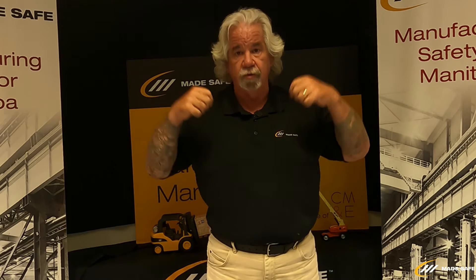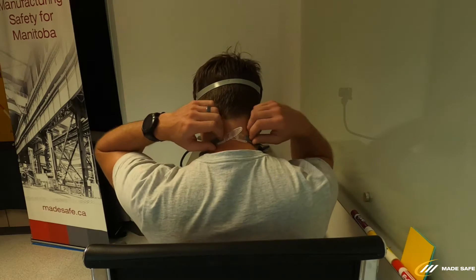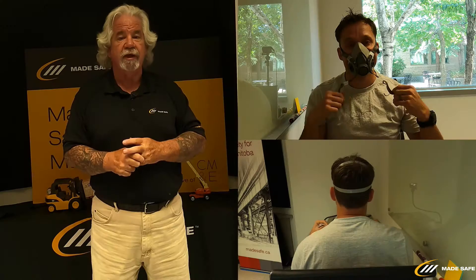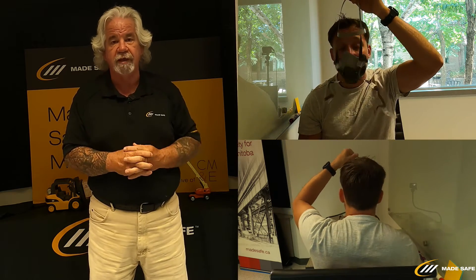For the negative check, I'll ask Reg to cover the inhalation valve with both hands and inhale slightly — the mask should vacuum down onto his face. We're making sure no air is coming into the mask; if there is, he'd readjust the straps accordingly. For doffing the half mask, we reverse the process. We don't want to touch the mask in case of contaminants. Undo the back strap first, then grab the bonnet part of the harness and pull it over your face.